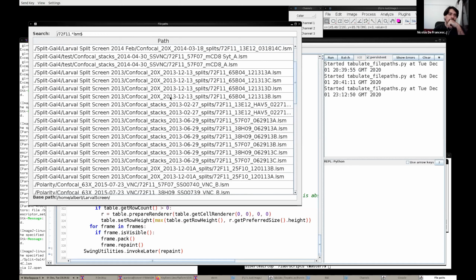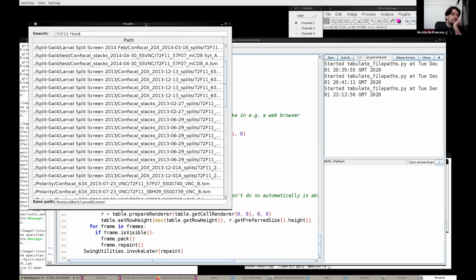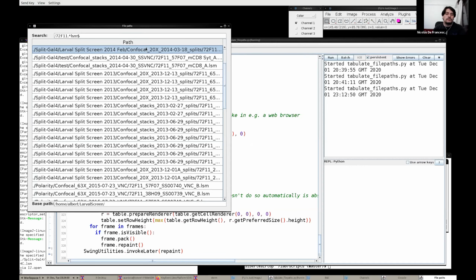And with that, we've demonstrated basically how to easily create a graphical interface, add hooks into it, these listeners that enable you to, say, double click on this or push enter on it to open a file or to print or do whatever you want. And also you realize that the components in there can be moved around, can be relayed out differently and so on, even dynamically, even taken from one window to another. So there's a lot of flexibility once you understand how this works.